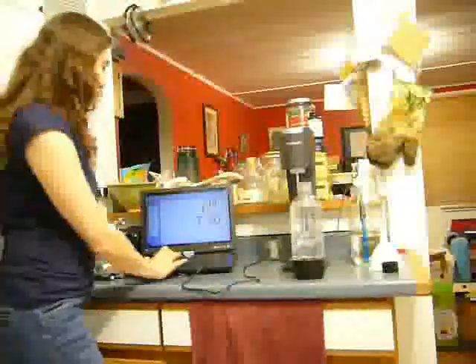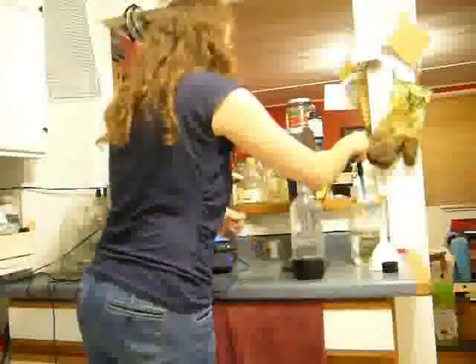Now, before I take my new pH reading, I'm going to take a look. So it was showing it actually equalized about 7.2. And if I click over here up on the software, it'll start collecting. So let's click on there, and it'll start collecting data for my graph. And I'm going to insert the probe into the bottle. Now, I'm going to try and get out of the way, so hopefully you can see that right away we're having a very large drop in pH.